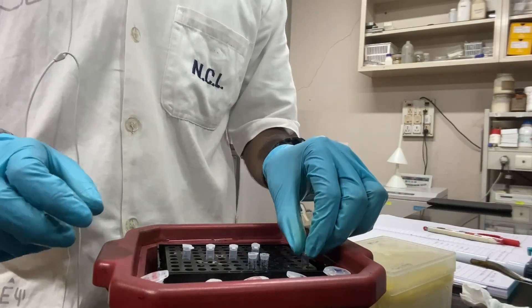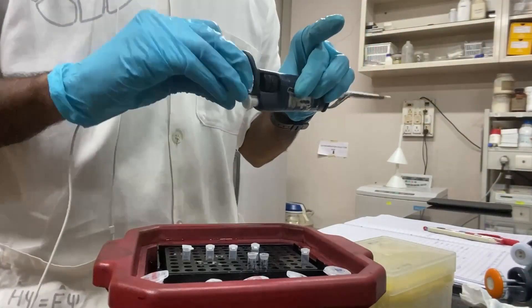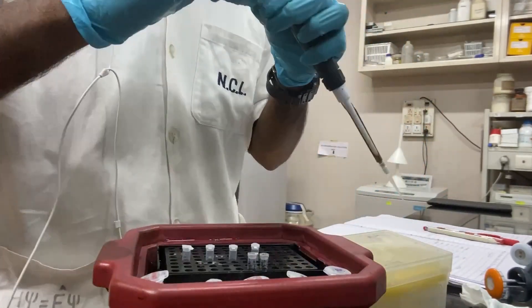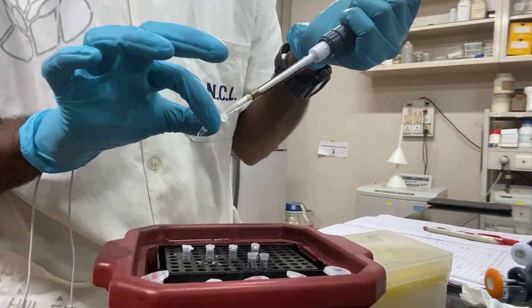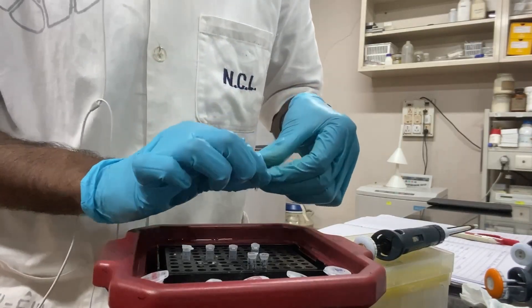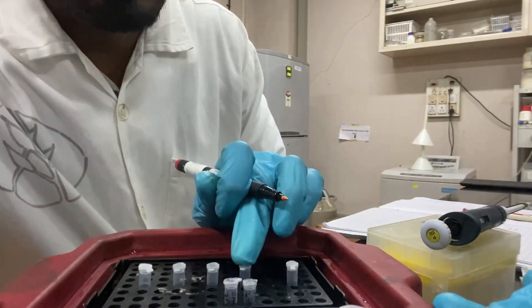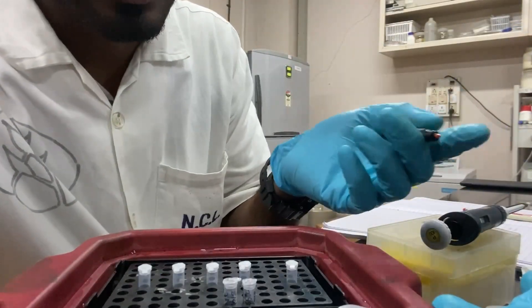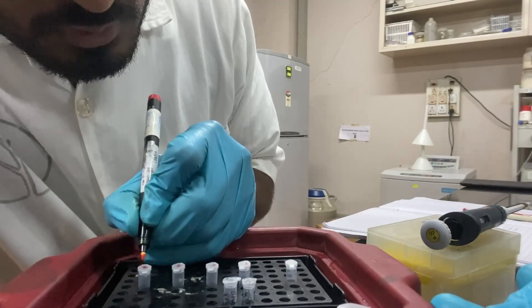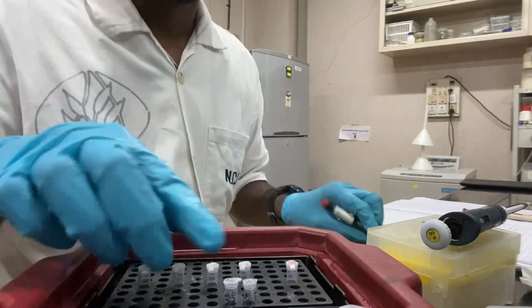Keep the reaction on ice. Now everything has been added except the template. I will mix it by pipetting, as well as give it a short spin so everything comes down to the bottom. Everything has been added. Now I am going to label my tubes — you can label them early, no issue. The first tube will be the negative control, so I will have five tubes here.